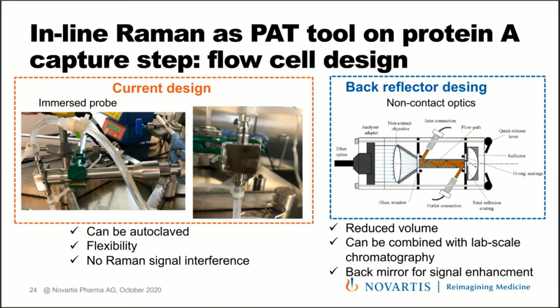In the past, we used probes for bioreactors, because mostly the development started from the USP. But with these new flow cells, we assess new areas, and of course, again, we had some limitations about the volume needed for that, and how these flow cells are scalable. When we need to develop different projects and process steps at lower scale, like for the capture step, we don't have such big tubing, so we need smaller flow cells.